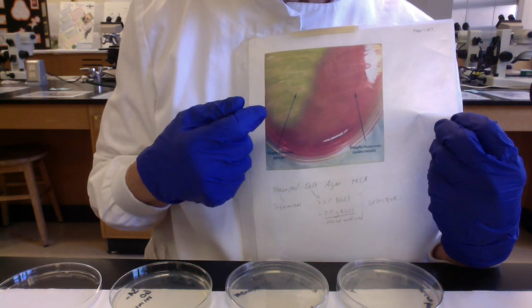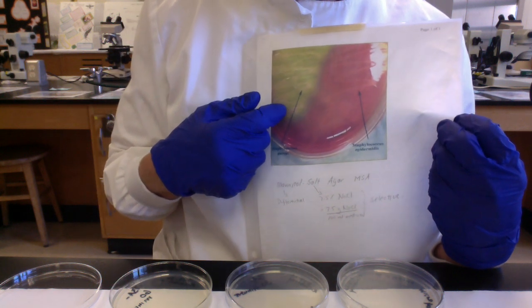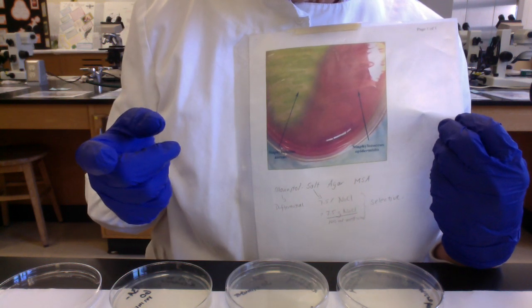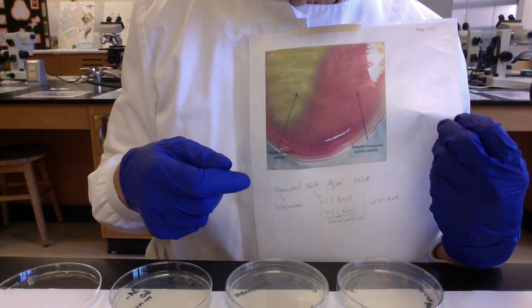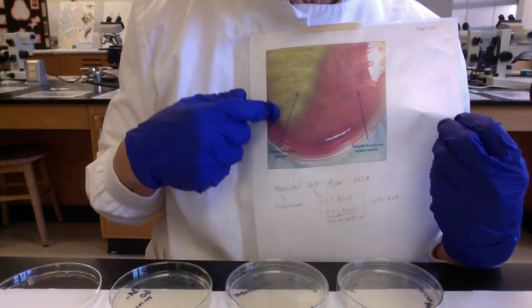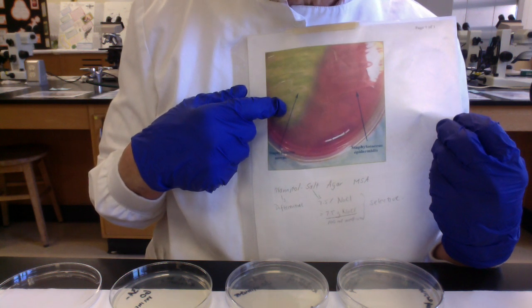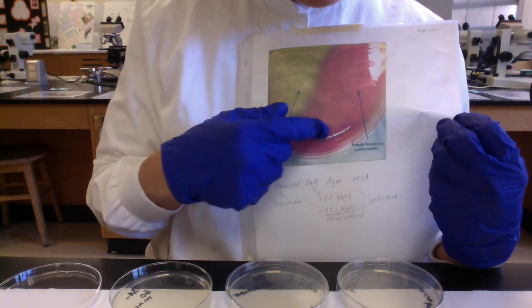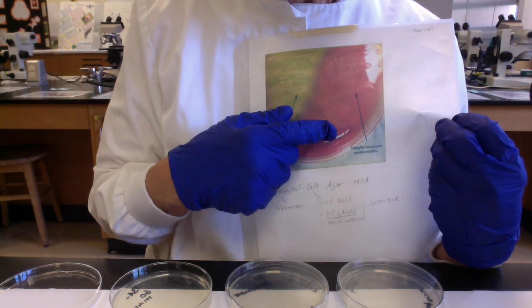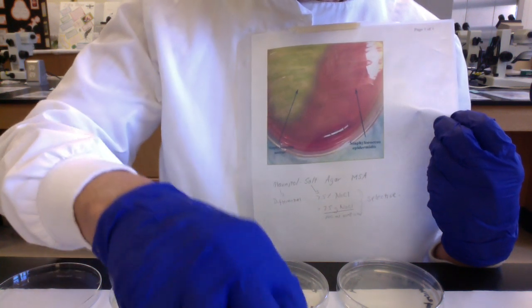Again, this is really helpful, especially if you have an abscess or maybe an infected surgical site. You take a sample of pus and inoculate it to blood agar and to mannitol salt agar. You incubate, and if you see yellow colonies, yellow medium the next day, you are definitely going to be worried that that could be Staph aureus. If you have colonies growing but the medium remains red, you're maybe not quite as concerned because that's a less aggressive Staphylococcus epidermidis. Okay, we'll stop that here.